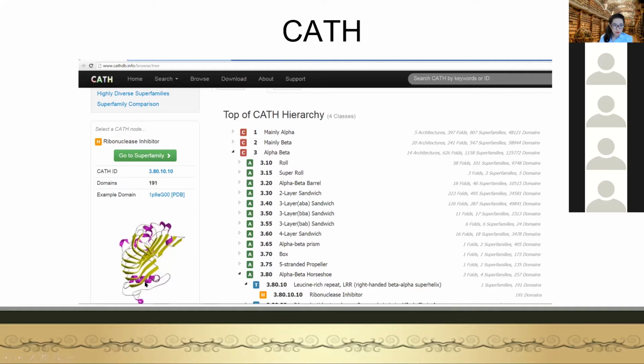So if you want to create the physical model by yourself, you can sift through this CATH database and choose the shape that you want, and you fold the protein by hand. And then you can have the structure like PP does, but we don't have ribbons here with you at home. So I will just show you that it's doable by going to the CATH database. So this is the secondary database. The Protein Data Bank is deposited by the crystallographers, but the CATH database is deposited by the ones who process all those data and classify them into the different folds.